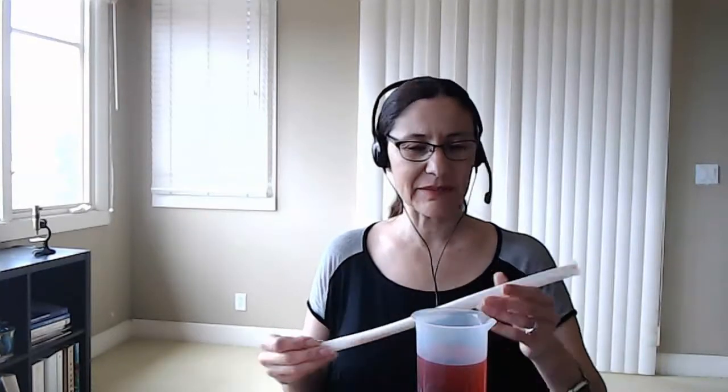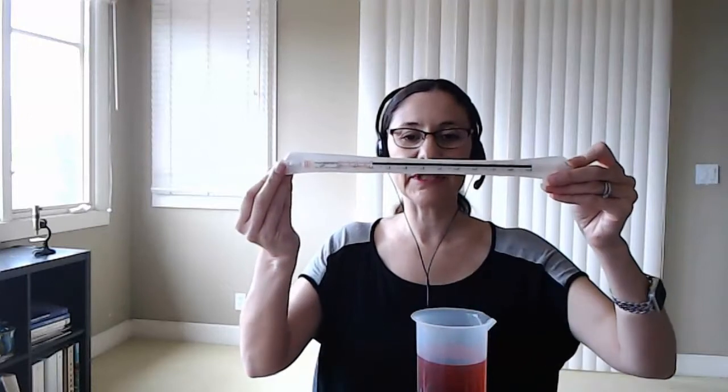So what I'm going to demonstrate for you is first a little bit about these pipettes. These pipettes are sterile. They come individually wrapped and they have the little area here that we can use to open them. I want you to notice that the pipette has a little cotton plug here.